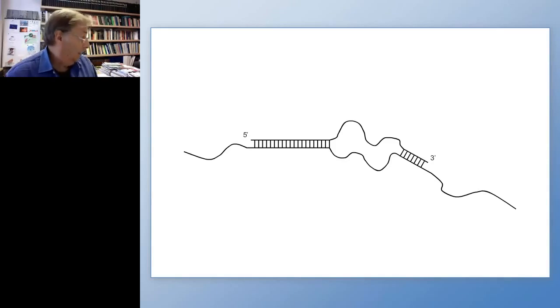Now, finally, it turns out that the most informative assays for assessing a cancer patient are multiplex assays that will look at different mutations that are relevant to cancer, things that determine which drugs you should use, what their prognosis is, how abundant they are. And many of these mutations occur in the same gene. So there are seven different key KRAS mutations that occur in two adjacent codons. I mean, these mutations may occur in different cells, but their location is within the same or adjacent codons. Same with EGFR mutations and BRAF that we were using.